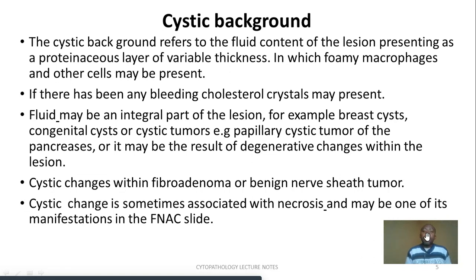They are hypochromatic in nature, and sometimes have either an eccentric nucleus or a central nucleus in the middle. We shall actually look at them and see exactly what we mean by foamy macrophages. So if there has been any bleeding, cholesterol crystals may also be present, and we shall see how these crystals appear in rectangular forms. We shall also look at them.